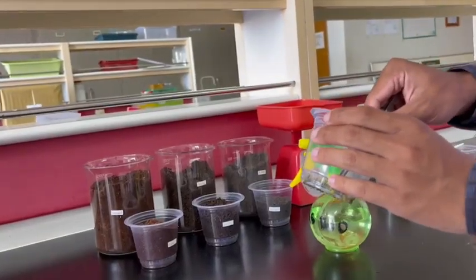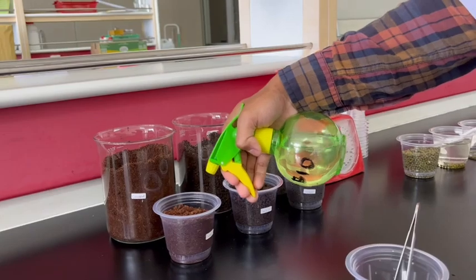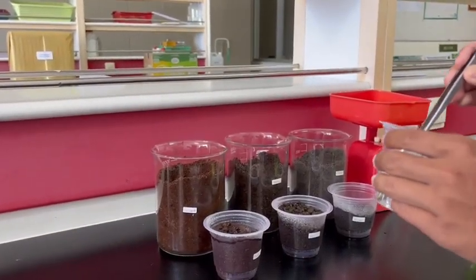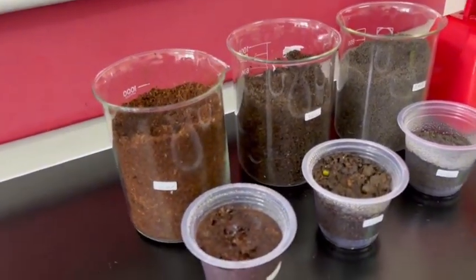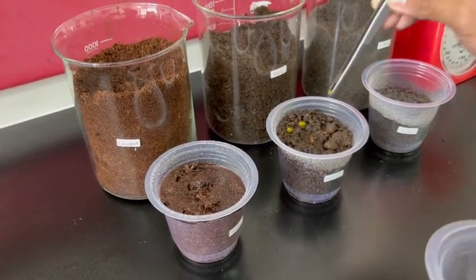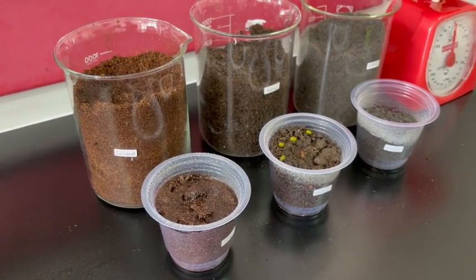I want to plant this seed here, but before we do that, I want to spray the media to make this humid media. Plant the mung bean in the media, and here I want to plant 10 seeds of mung bean on each media.